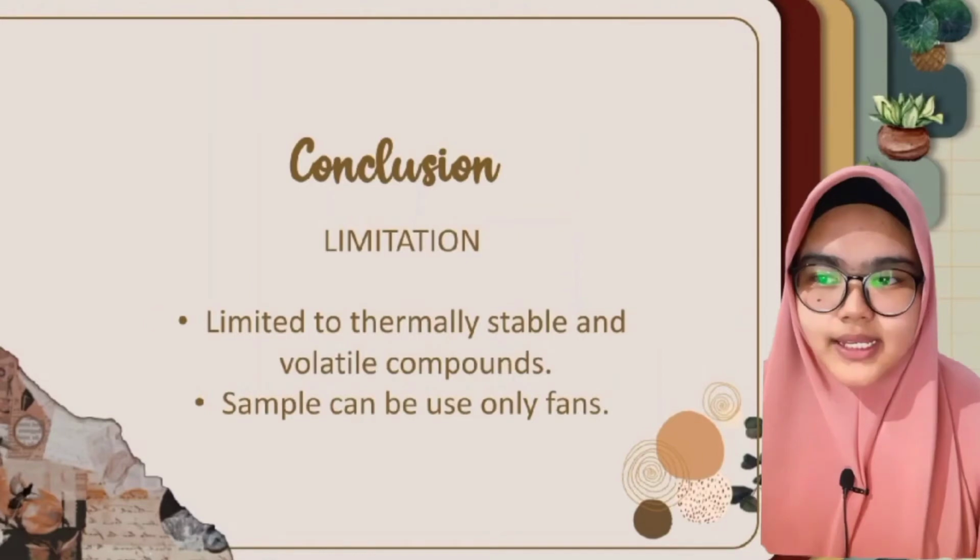The sample has been destroyed when it goes through the detector. Therefore, it cannot be analyzed for future research.